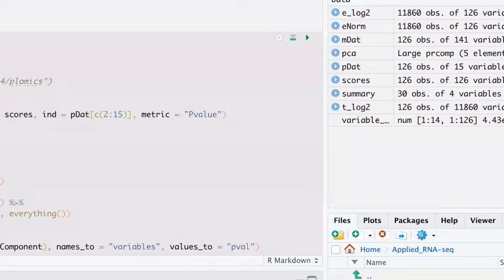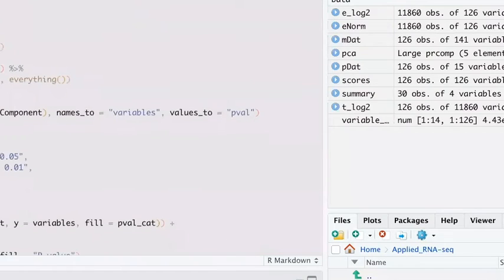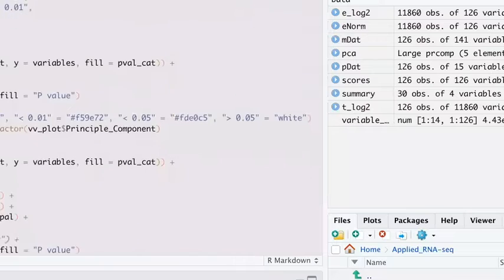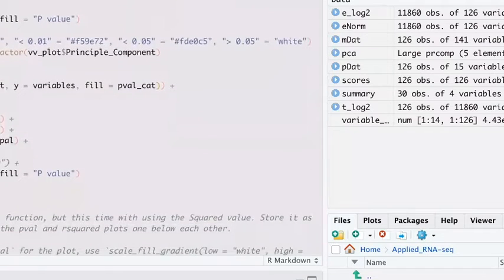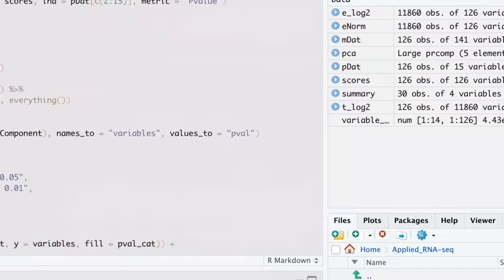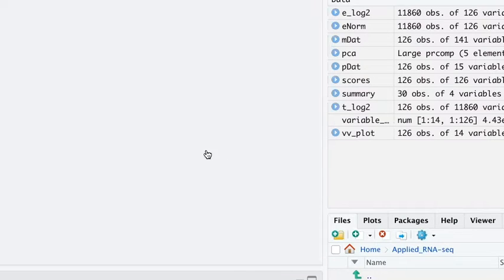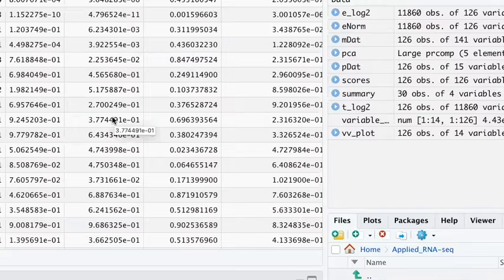And I think it's basically all of this. Let me check. Okay, yes. So if you just run the whole thing here, we're converting it to a data frame. We're calling it VVplot as data frame. Then we're transposing the data frame, so again, rows to columns, columns to rows. So that's what it will look like. So now we have everything in a bit of a tighter format.